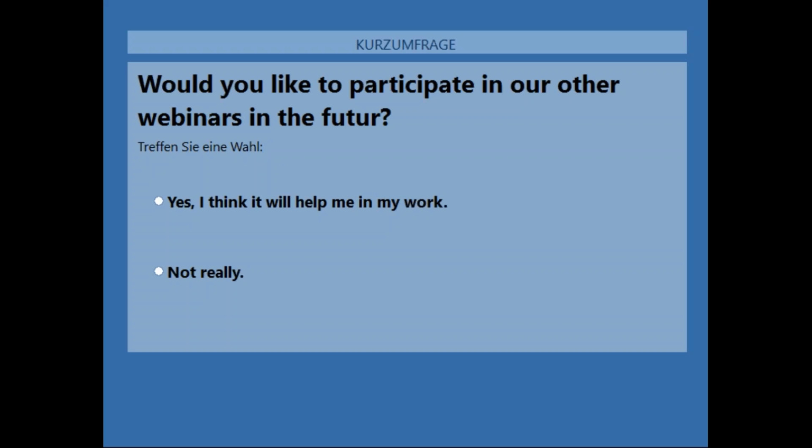Okay, meanwhile, we have another question from Chen Long. We also have an optical profiler, but I missed the last webinar. Is there any way to see the recording? That I could answer. The answer is absolutely yes. Next week, we're going to send everyone the recording as well as the presentation link, so you could see it afterwards.